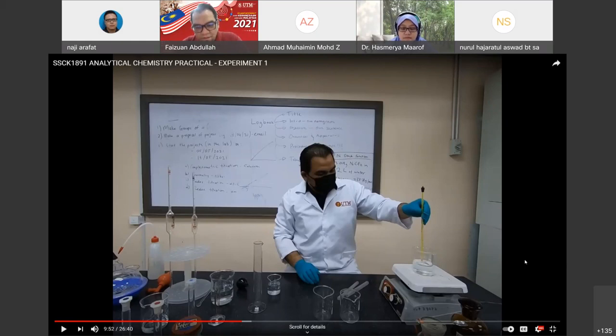And also, you can see in the video that has been paused by Dr. Haas, I'm holding the mercury thermometer to measure the heat of the solution. So, can I stir the solution using the mercury thermometer? Because it looks like a stirrer. We can use the 2-in-1. So I want to ask Bupa: can I stir the solution using the mercury thermometer?